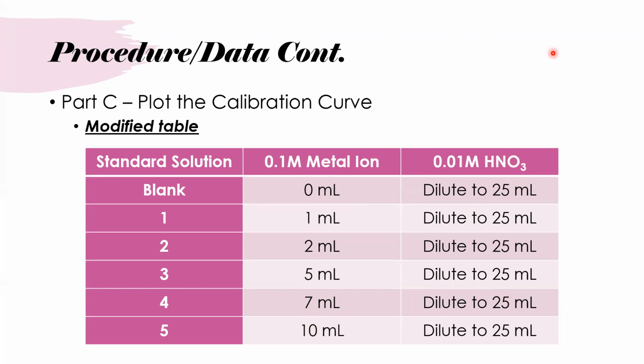So will we only fill out part A and C and all the post-lab questions? Yeah, you're only going to be doing part A, C, and D, because we haven't gotten to D yet, as well as the post-lab questions. And then you should be making a graph for this calibration curve.